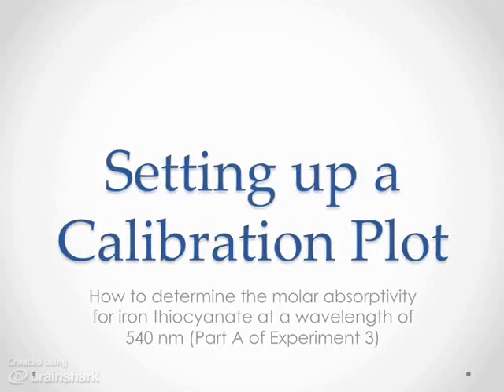For this video, we're going to talk about how you set up a calibration plot for your iron thiocyanate experiment. This is going to allow you to determine the molar absorptivity specific to iron thiocyanate at a wavelength of 540 nanometers.